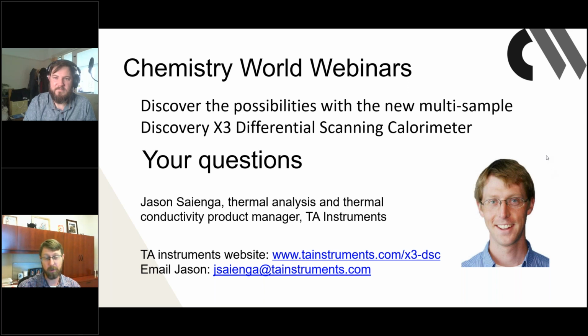So that's really the only word of caution I guess I would have when running significantly different materials. But yeah, it's one program, one method. They all just see the same thing, but they don't have to be the same material. So one sort of heating and cooling regime, but yeah, the materials can be as distinct as you like.